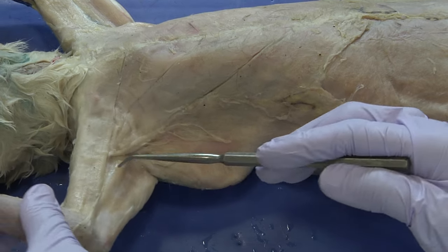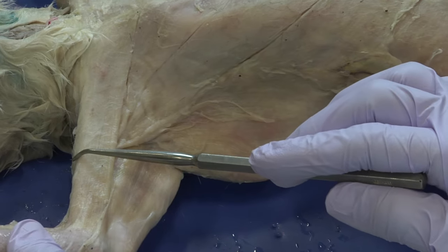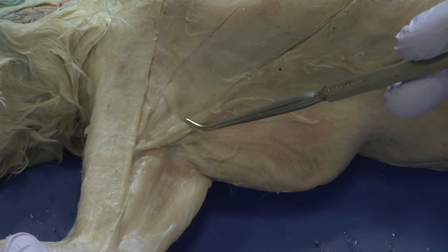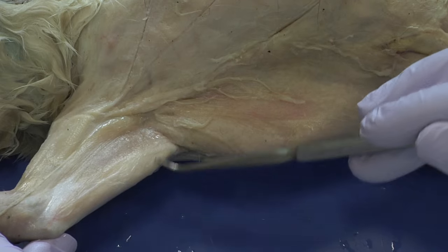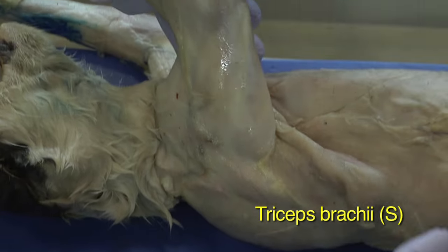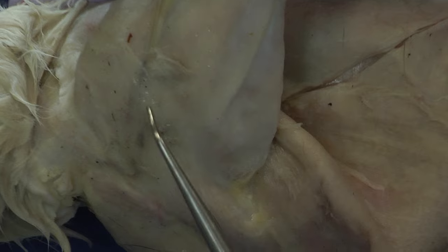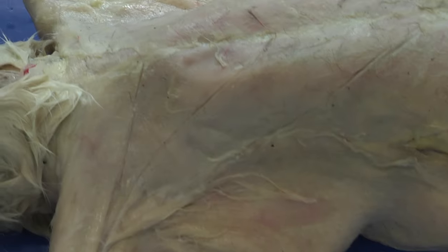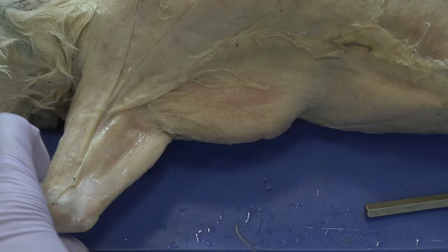To expose the biceps, we'll need to cut across the midline of the overlying muscle and reflect it back. The tricep is already revealed, and its other head groups are visible. For the biceps, we need to remove the top muscle by creating incisions. To get a better angle, I'll rotate the cat to the dorsal side and make the incision where these two muscle groups meet, separating along the line where the triceps go underneath.